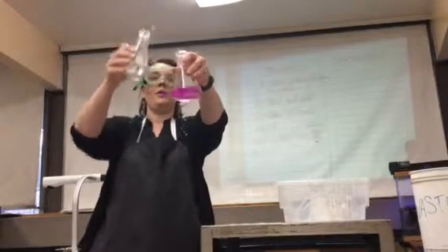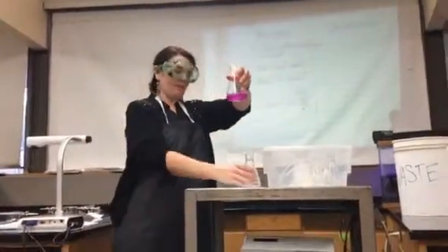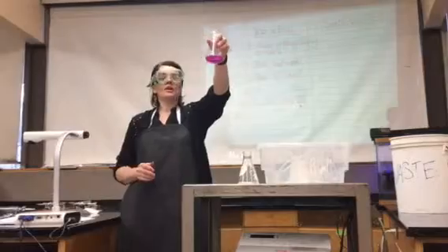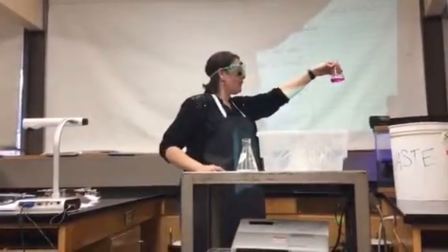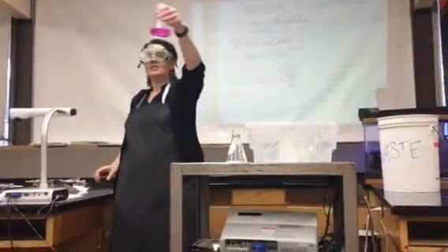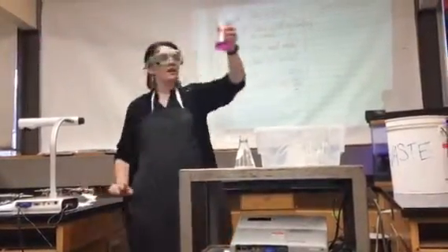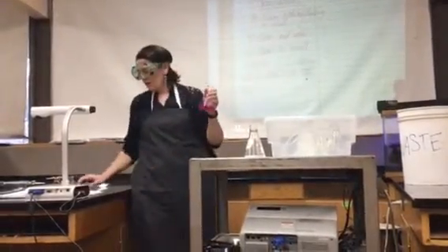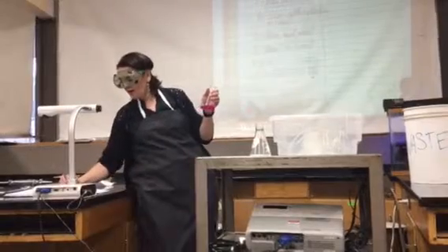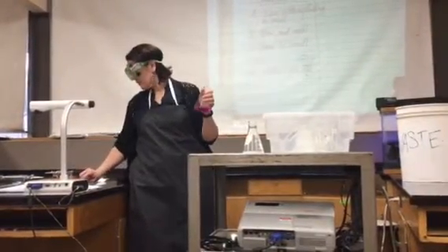What the devil? What just happened? Okay, write your observations. What do you see? What happened? It turned bright pink. Is that A and C? This is just B and C without A. B and C. What do you think will happen when I add A? It's a pretty pink. I know, so bright.